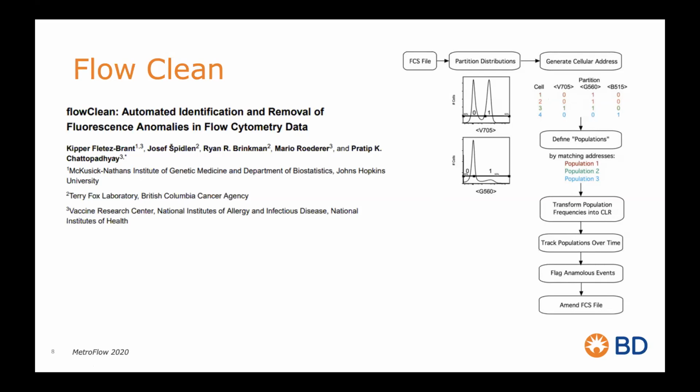If they are all in the first couple of seconds, then that's an indication that particularly high values for all the parameters or something like that might be an artifact produced by the machine. And then it'll take out those cells just like FlowAI took out the ones that either missed by flow rate, etc. So similar tools there.